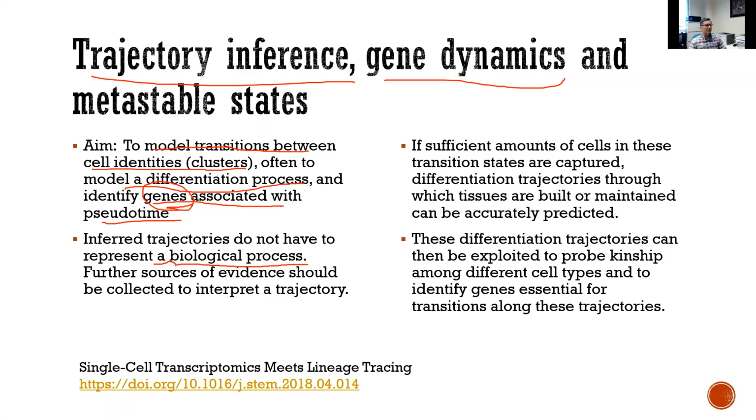But because single-cell RNA-seq gives you enough cells, you have a large sample size, so you can reconstruct these transition states very accurately. There are a lot of cells distributed between different stages and merged from one stage to another. So you merge the cell clusters into continuous trees, paths.